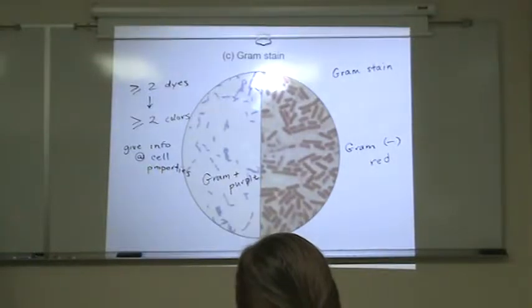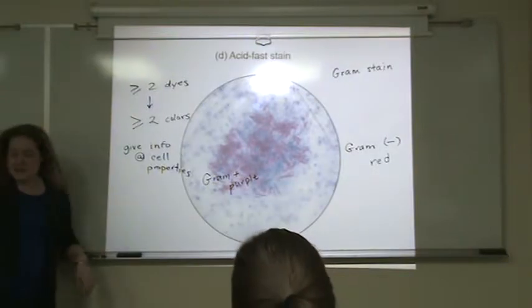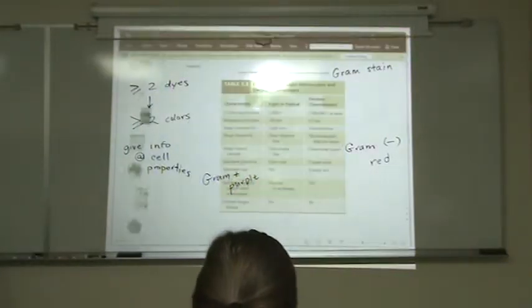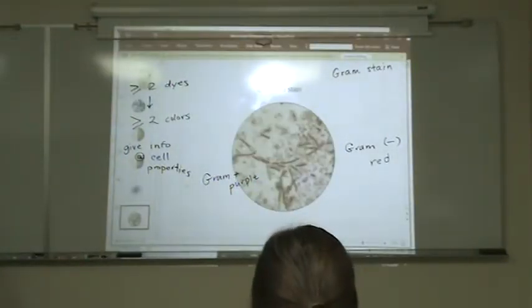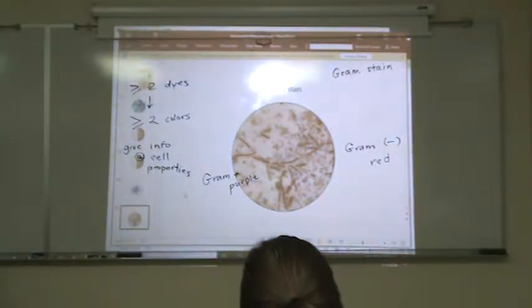So we'll be doing that next week in lab. Acid fast, I'm not going to go through particularly. We looked at a spore stain yesterday. The one that we looked at was not differential, it was simple. Actually, it used to be differential, and the green, those are old, and the green dye has faded away.